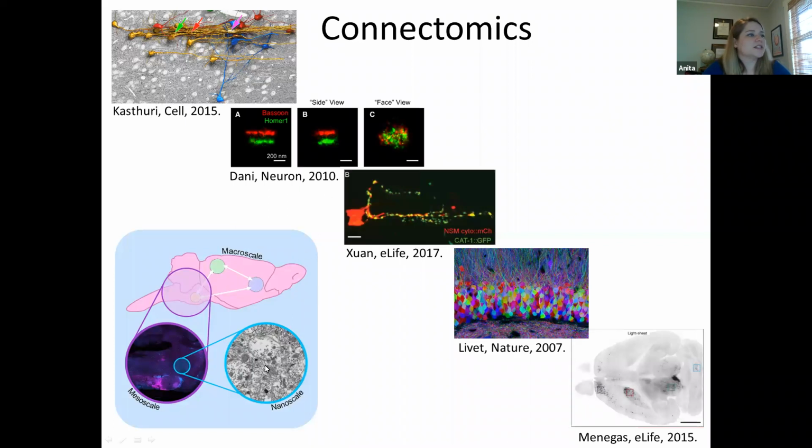So then of course there's more at the mesoscale. Here we're showing STORM imaging of synapses, so of course the presynaptic and postsynaptic sides of a synapse. Here, actually, this is from Perry Krishan in our department. They showed a whole neuron and some of the synapses along a neuron. So this is, again, at the mesoscale, looking instead of at single synapses, at multiple synapses.